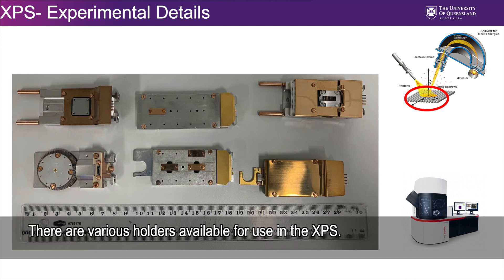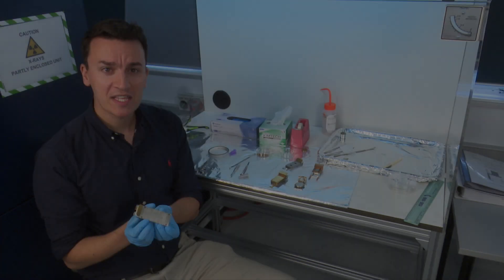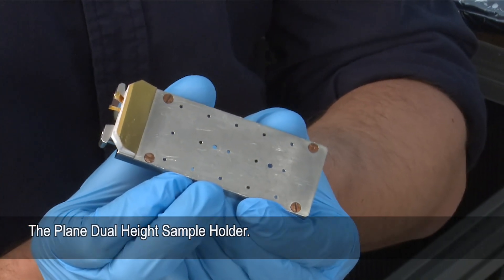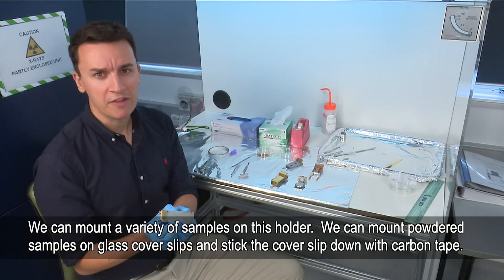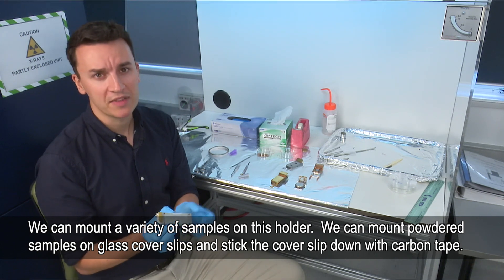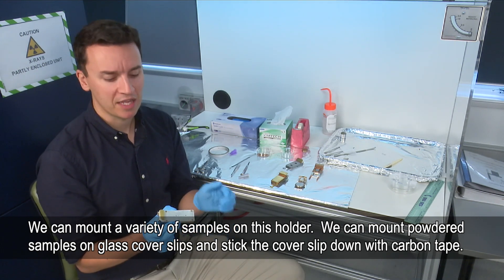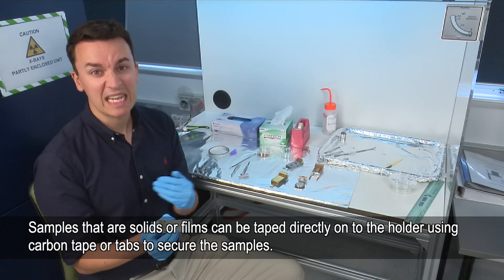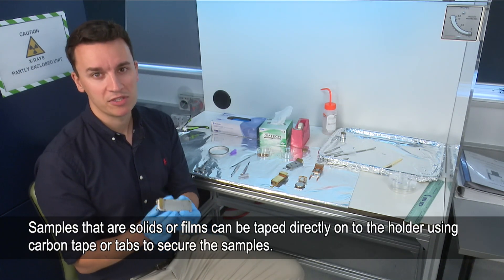Depending on the type of sample, there are different holders available, so I'll go through those one by one. This is the plane dual height sample holder — it has a nice flat surface. With this we can stick a variety of different samples: if we have a powder sample we can stick these to glass cover slips and place them on the surface. If we have solids or films we can either tape these or use carbon tabs to hold them in place.